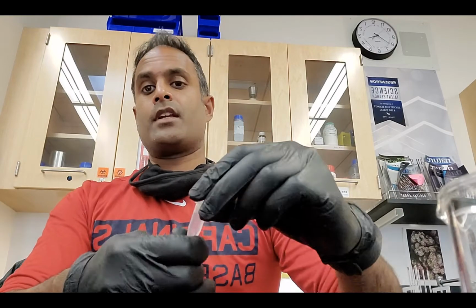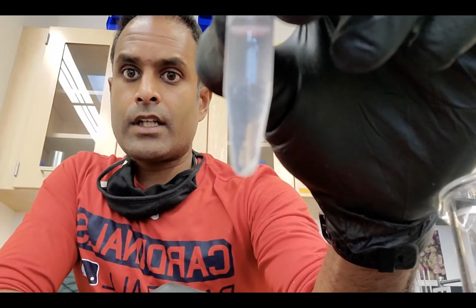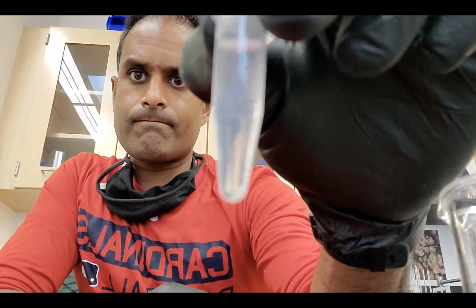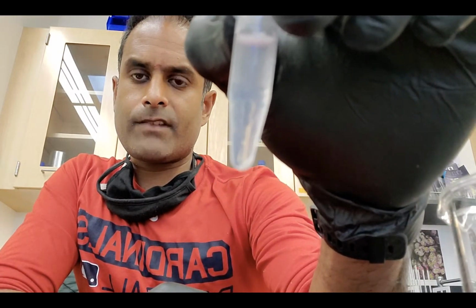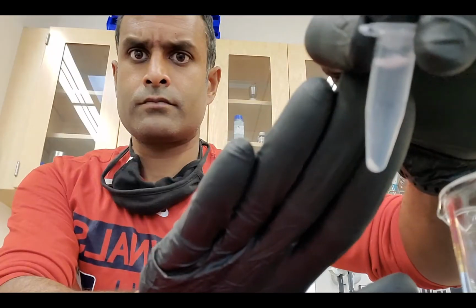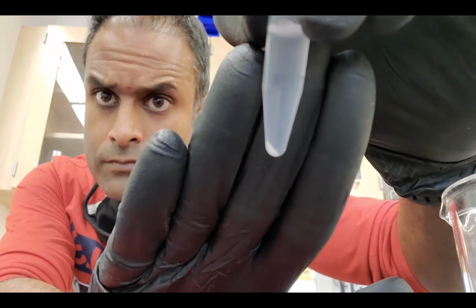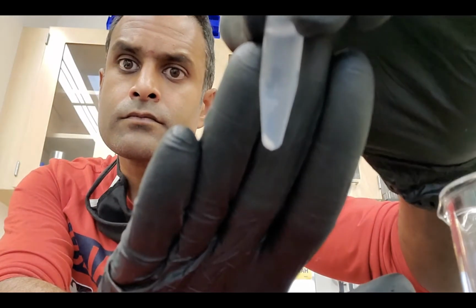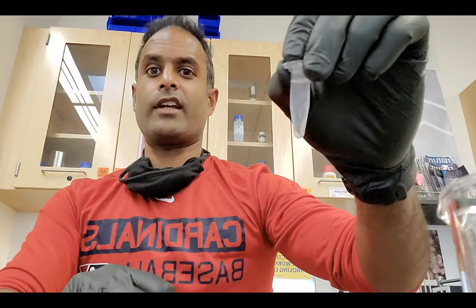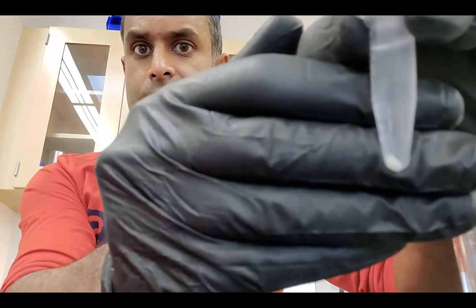Okay, this is what my sample looks like right now. If you'll notice, that's kind of hard to do. Focus, focus, focus. Okay, great. So I'm going to focus this by doing this. All right, here we go.